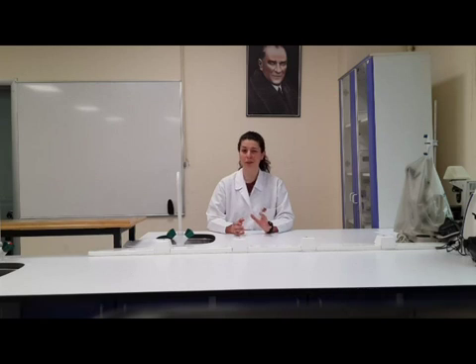Hello everyone! On this lovely Sunday evening, we had some technical issues, so we are a little bit late this time. As we all know, this is the last video. In this video, we will talk about how to analyze the data obtained from the flow cytometer and all kinds of details. Additionally, we have some representative results for you.